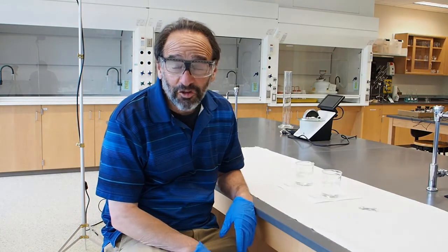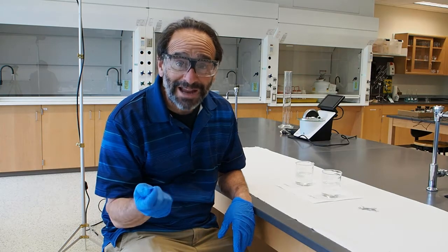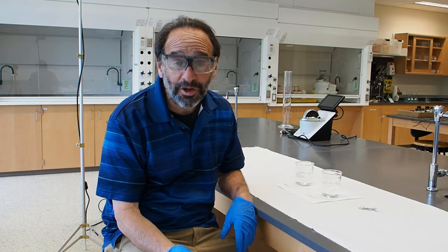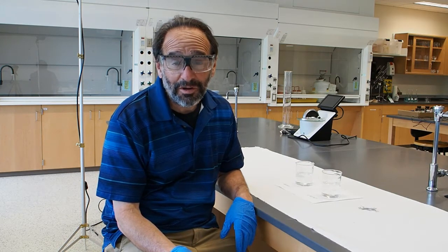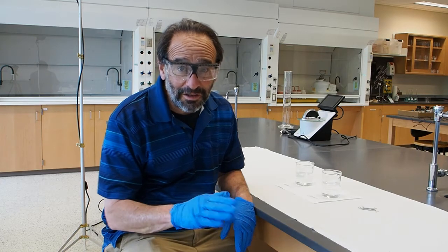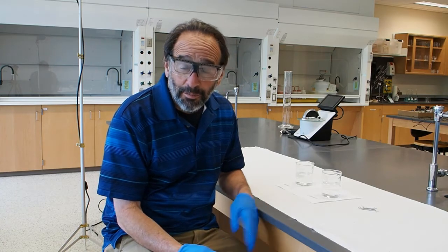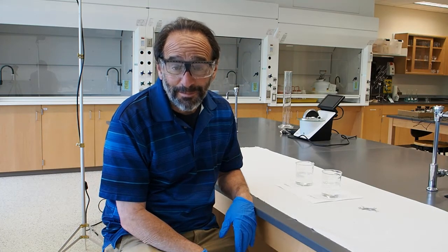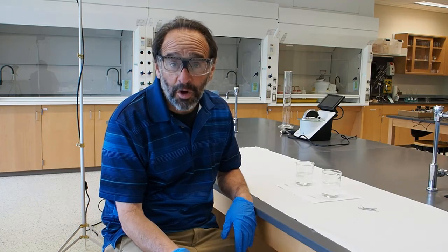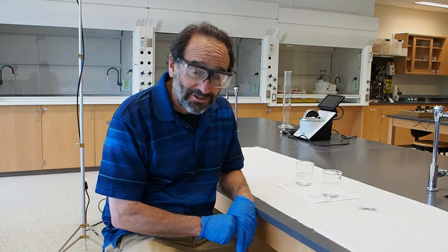Okay, so we've seen that sodium dissolves in water. It dissolves not because the sodium itself dissolves, it actually reacts. The reaction leads to a compound that contains the sodium that is now dissolved. So you can dissolve sodium into water, but it's no longer sodium metal in the neutral state. Next we're going to look at magnesium, which is to the right of sodium in the periodic table. We're going to first add it to water, and if it doesn't dissolve in water, we'll move on and add it to a 1 molar solution of hydrochloric acid.